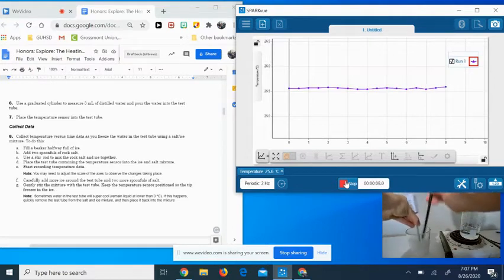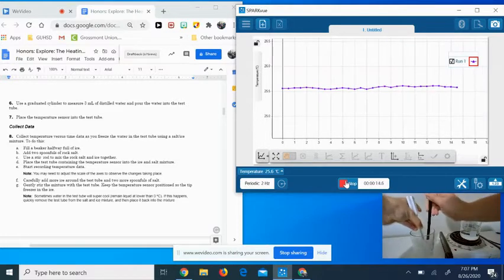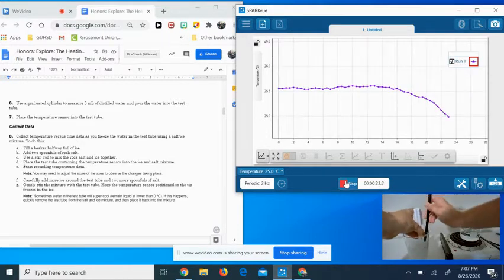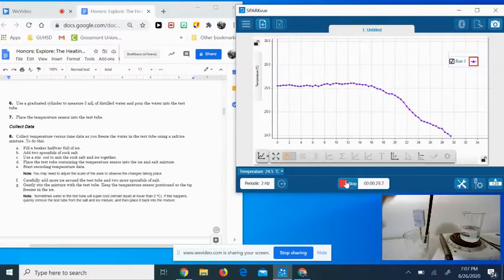And what I want to do is I want to get this so that it's starting to melt. Okay. So the ice is starting to melt on the outside, and while that's happening collectively on the inside of my test tube, I'm getting the water in the test tube to freeze.